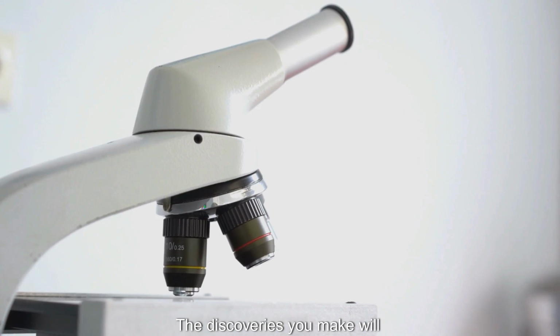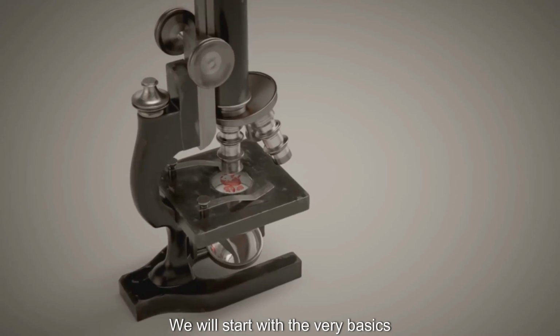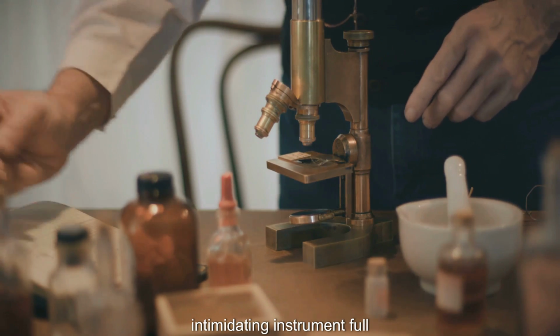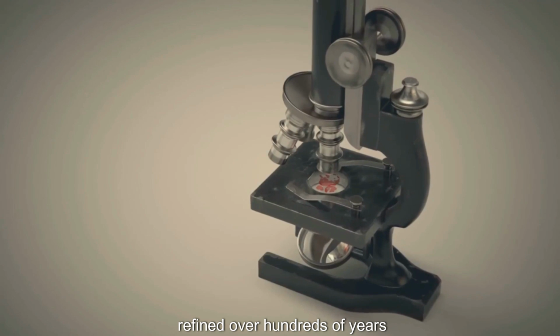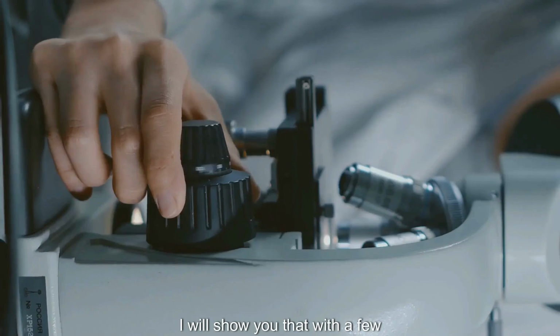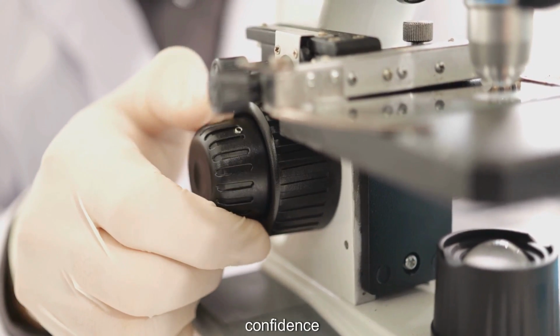The discoveries you make will be your own, witnessed with your own eyes. We will start with the very basics. A microscope might seem like an intimidating instrument full of lenses and knobs, but it is really just a powerful magnifying glass, refined over hundreds of years. We will demystify this tool. I will show you that with a few simple steps, you can learn to control it with confidence.